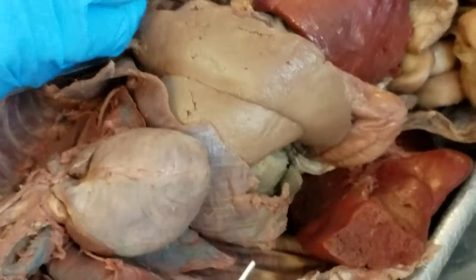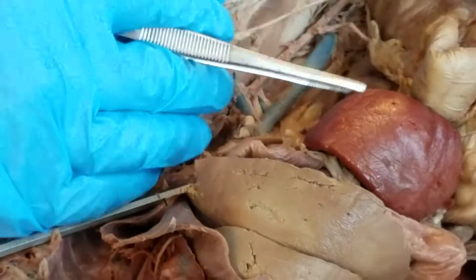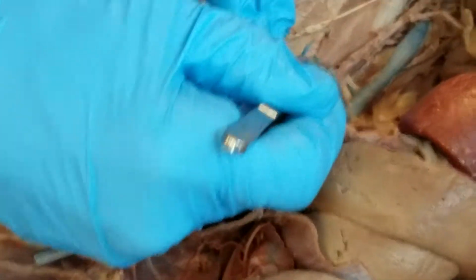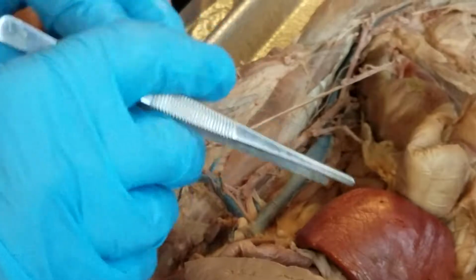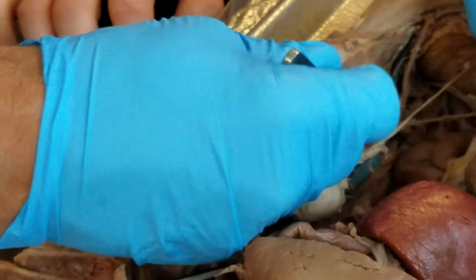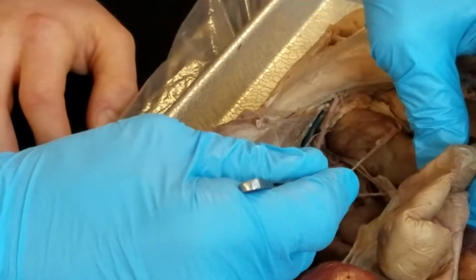So then this next major branch is superior mesenteric, feeding the upper mesentery, like greater omentum and stuff. And then right here is the renal artery, and there's your renal vein. And there's your ureter. Okay? So let's throw this out of the way now and follow it down. The last major branch before we bifurcate is the inferior mesenteric.